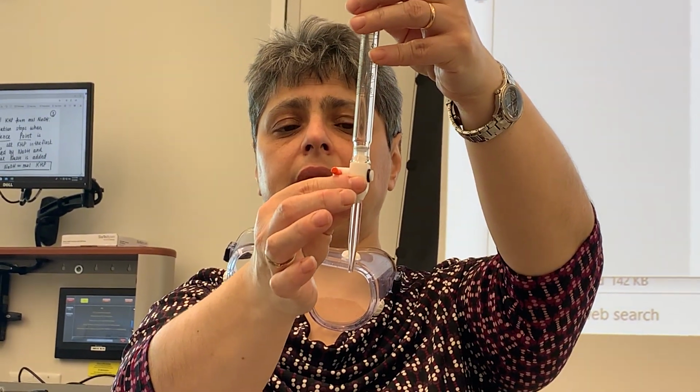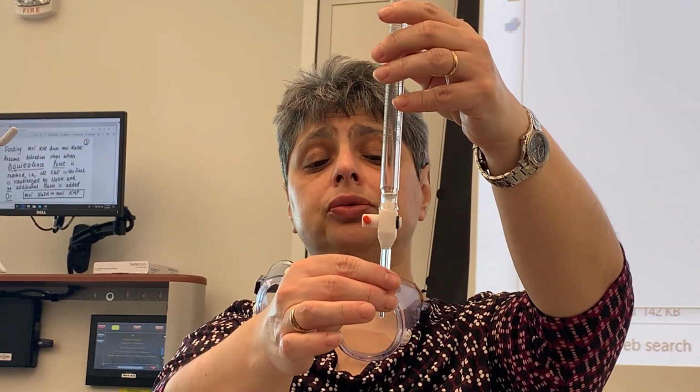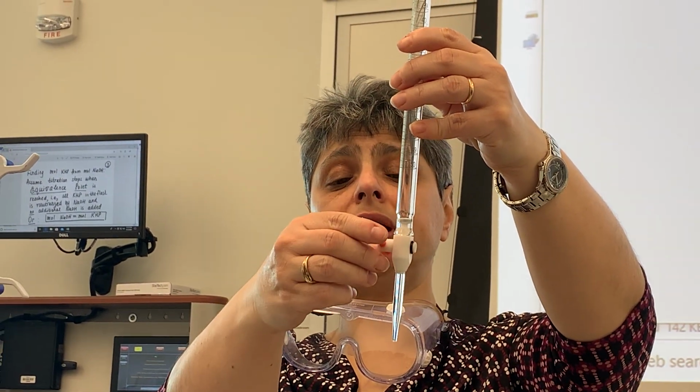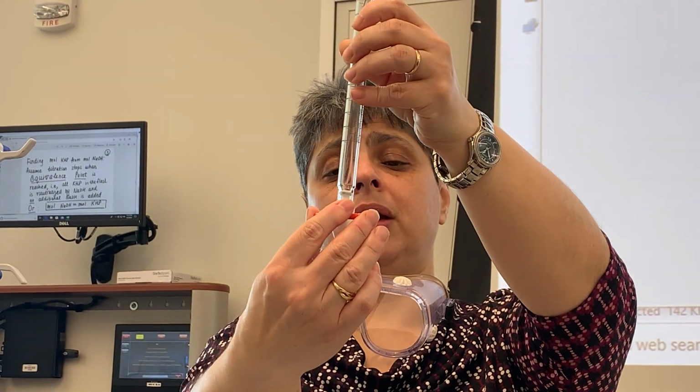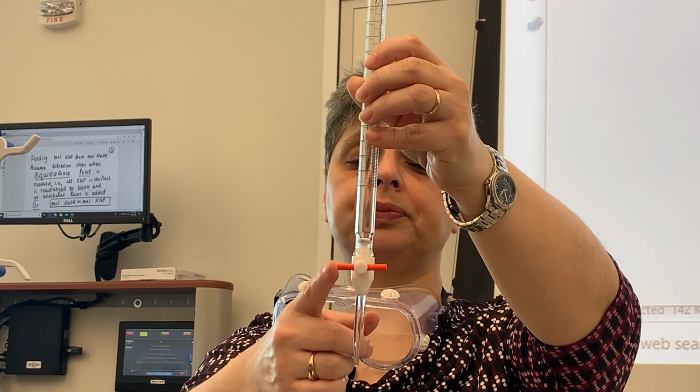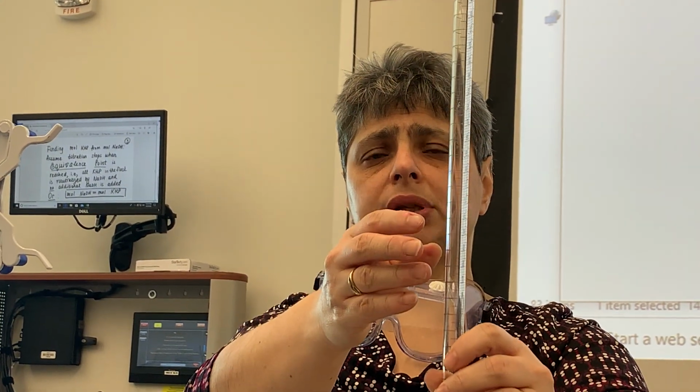It's made of Teflon. Stopcock can be operated to allow liquid to either come out in full stream or in drops, or not come out at all. Right now I have my burette stopcock closed, so no liquid would come out, but burette right now is empty.